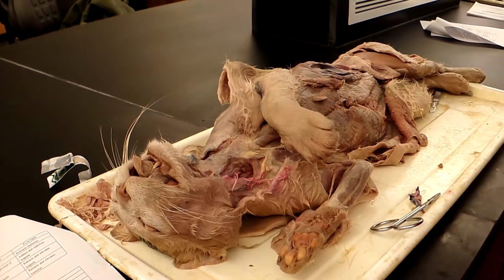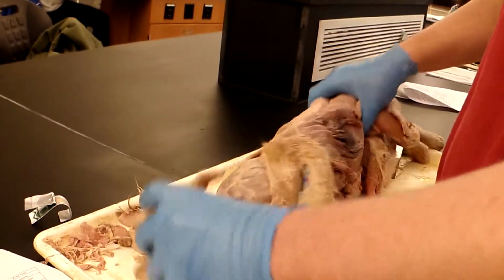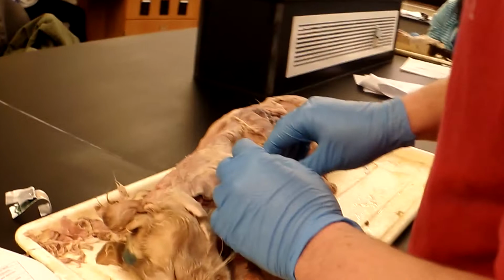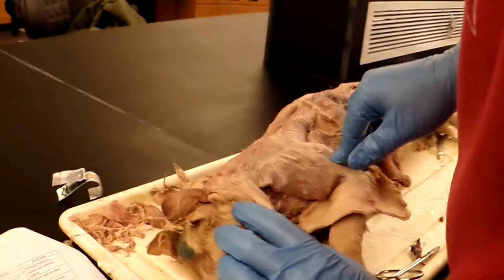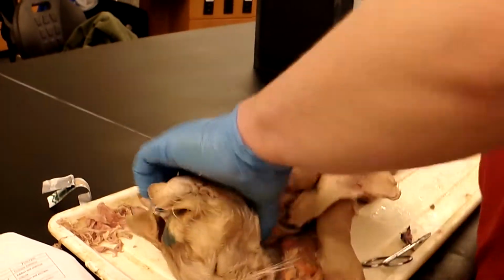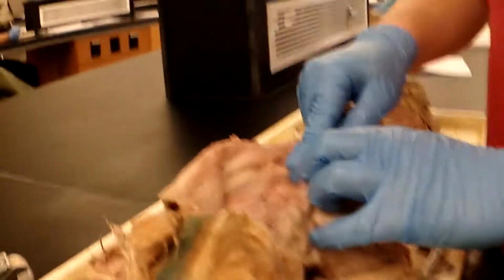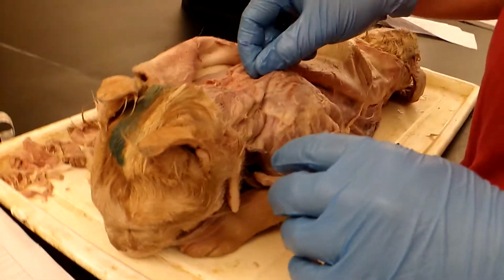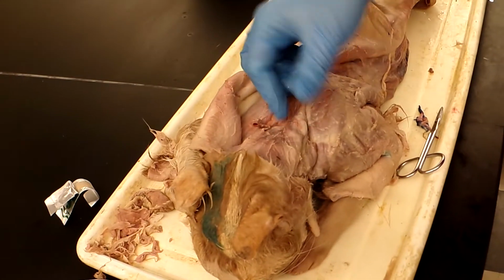Moving on to the deep neck and back musculature. I gotta flip the cat over one more time. First is the rhomboideus capitis, which is located right down the middle of the back between the shoulder blades, so it would be right here. The origin is the occipital. The insertion is the scapula, and the function is that it protracts and rotates the scapula.